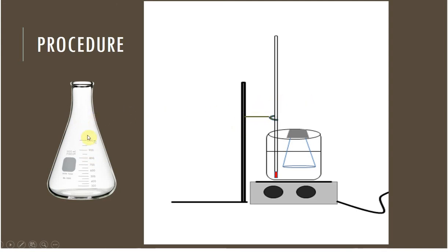You're going to cover it with the foil, the rubber band, poke two to three holes in it and put it in the water like this. This is also going to be ring stand clamped. You want to go as far down into the water as you can, but preferably not have the foil get wet, because that could affect your measurement later.